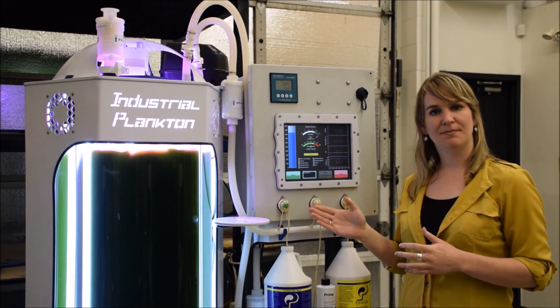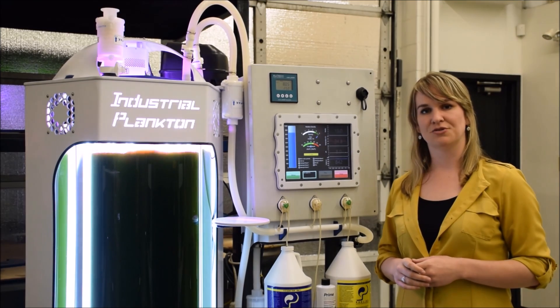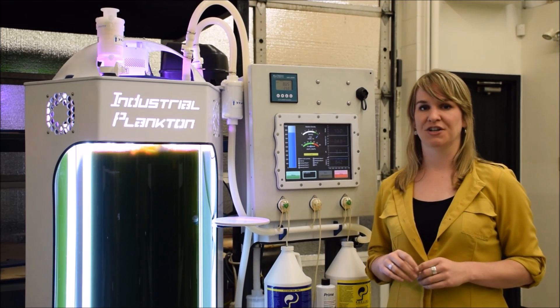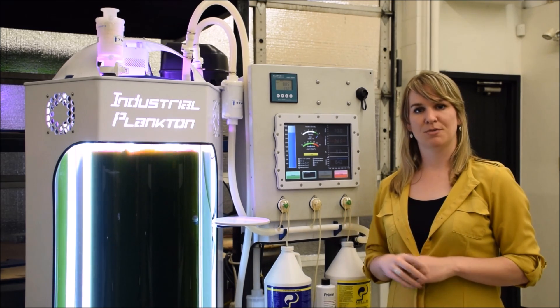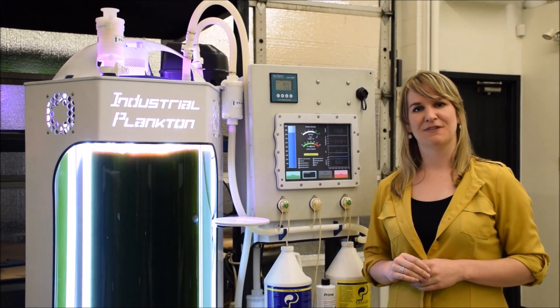The user has full ability to control all of these parameters and other vital parameters in the touchscreen controls. When you're ready to re-inoculate, it's just like a dishwasher. Add some chemicals, push a button, come back in two hours, and you're ready to re-inoculate with your fresh culture.